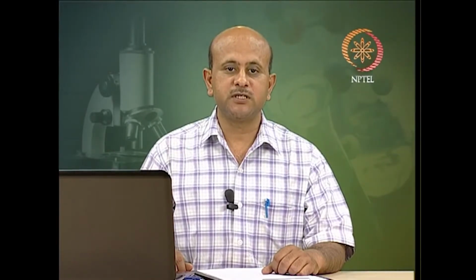In this lecture, we are going to discuss two light microscopy techniques which utilize the phenomenon of fluorescence: fluorescence microscopy and confocal microscopy, the extension of fluorescence optics. Now, fluorescence microscopy is a technique that utilizes the phenomenon of fluorescence to generate an image. It is an extraordinarily sensitive method for detecting minute amounts of material in a specimen. As for any fluorescent material, the total intensity of fluorescence is proportional to the intensity of incident light.